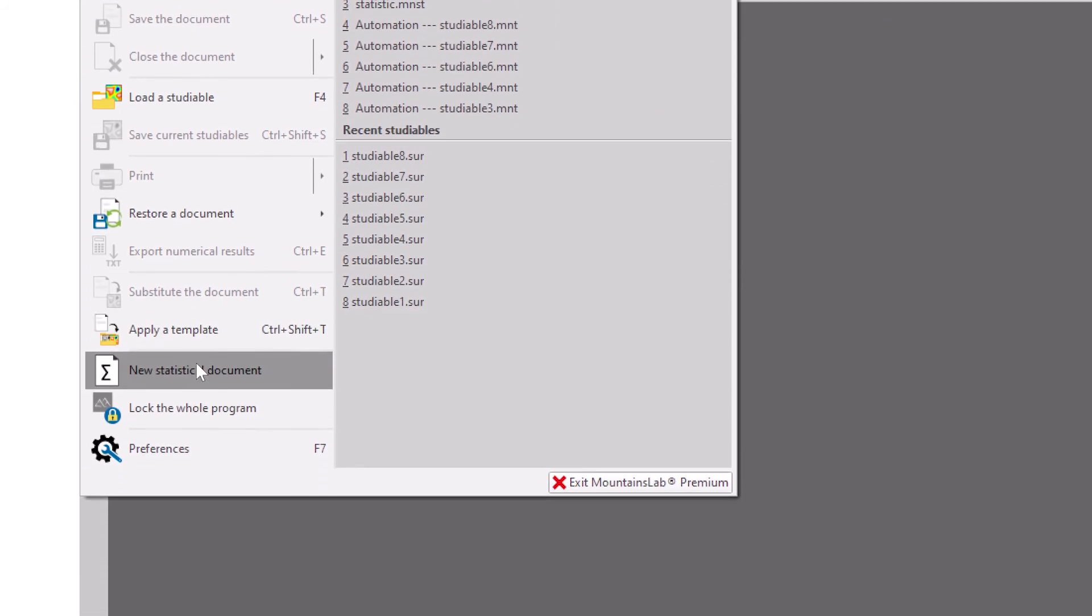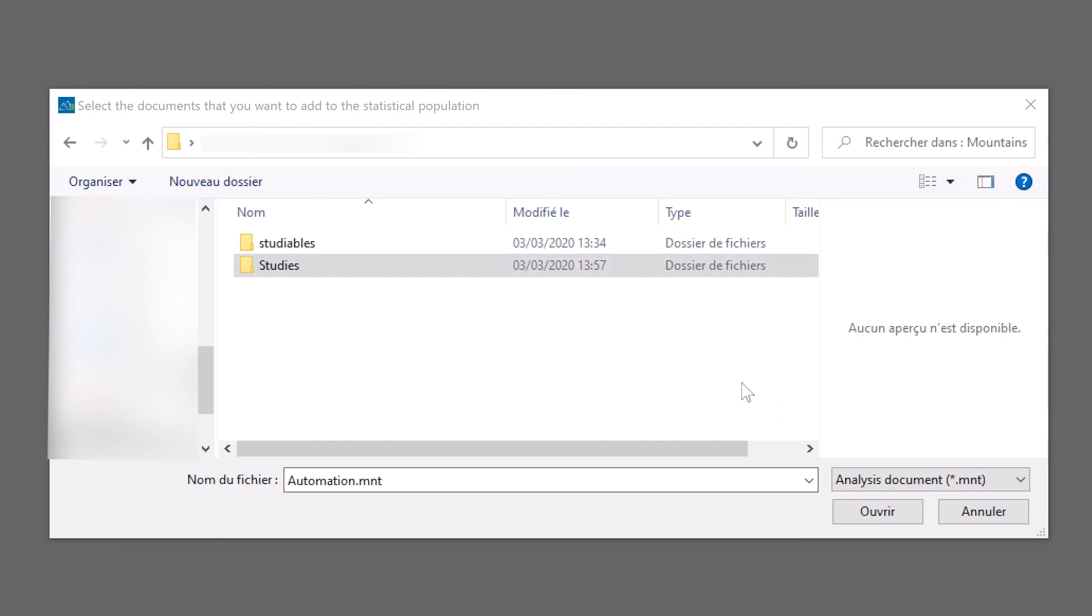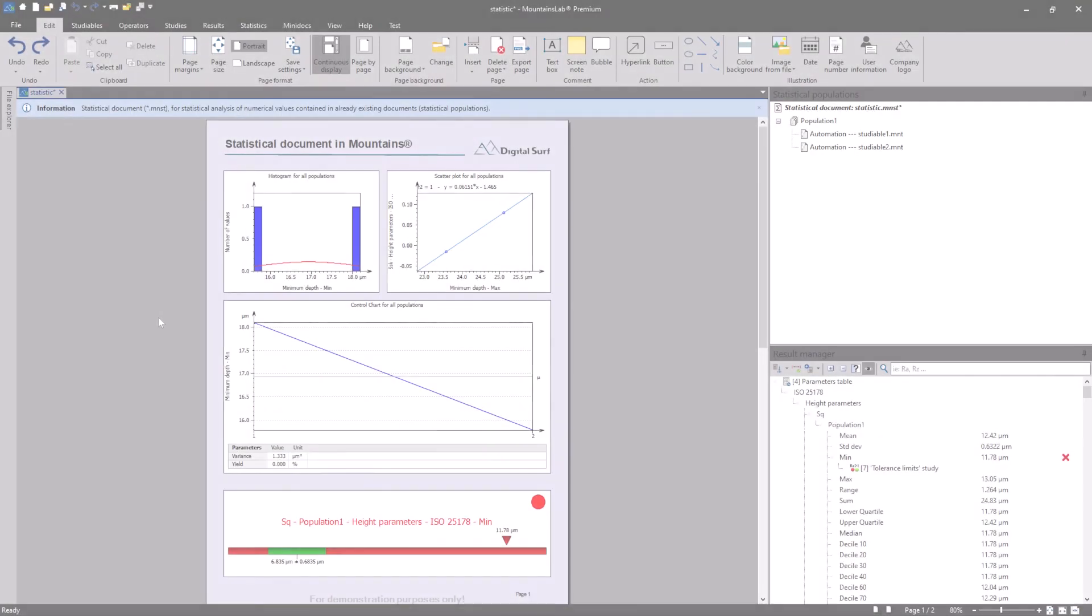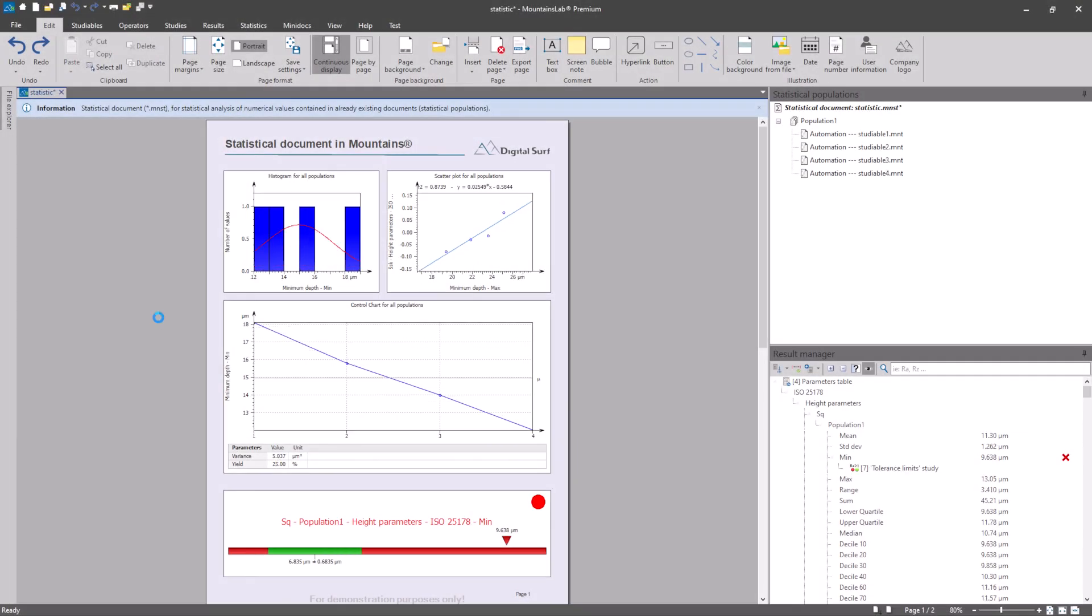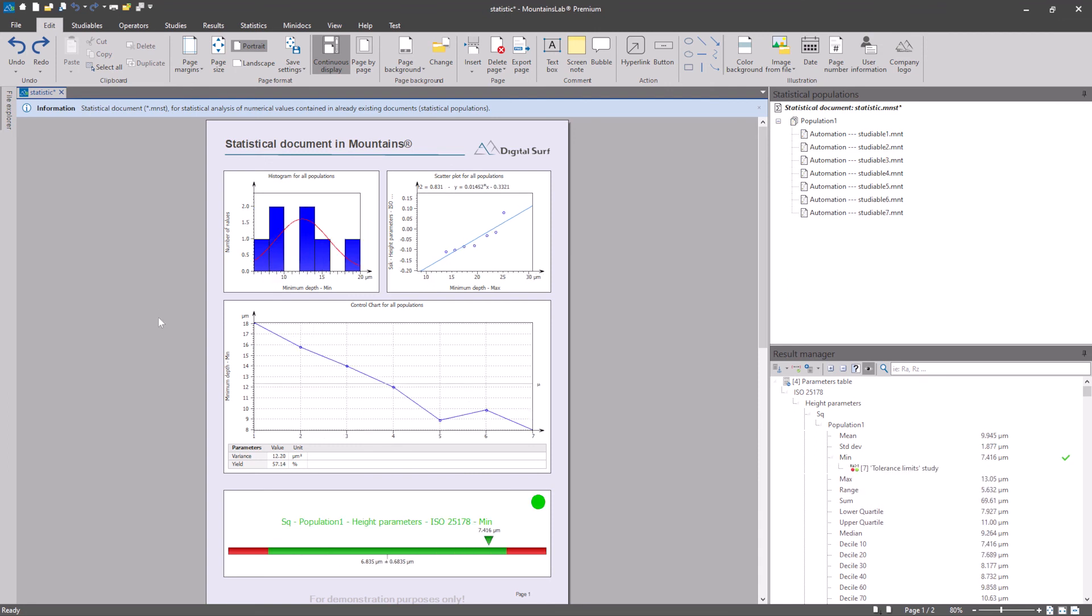Mountains creates a statistics report based on these measurements. In the case of a dynamic population, the statistics report is updated continuously to take into account any new measurements added to the folder.